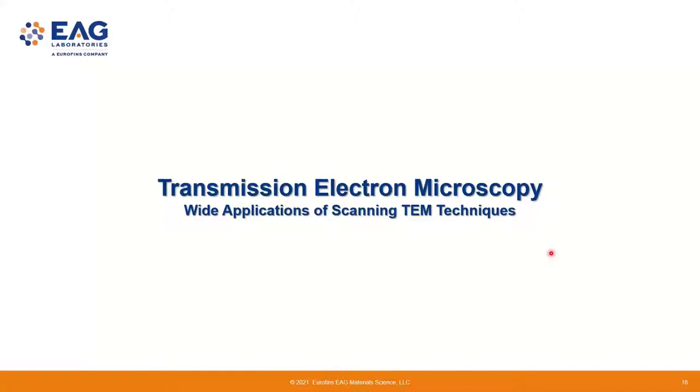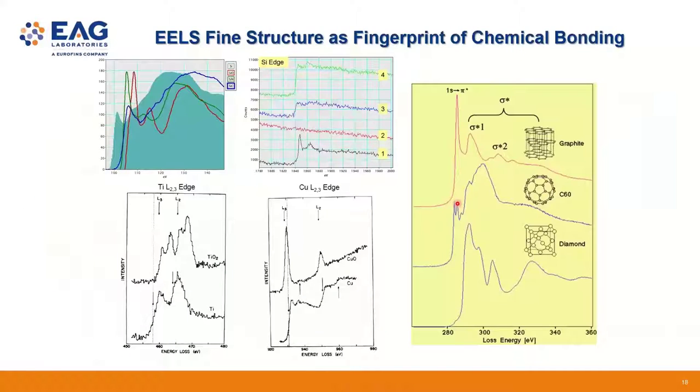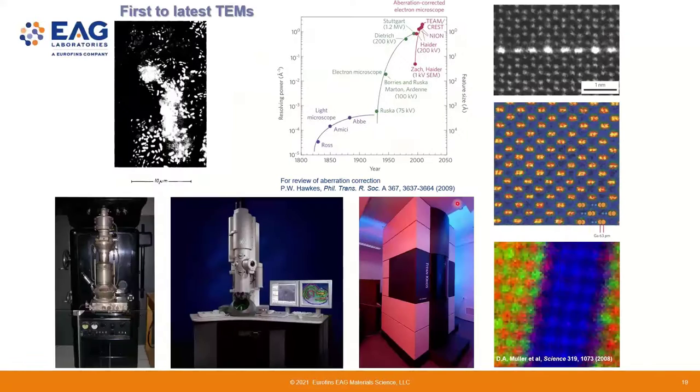EELS, again, for most of the time is a STEM-based technique. Nowadays you can collect EDS and EELS analysis simultaneously, an EELS data set, and then the rest is basically about data analysis, right, of the three-dimensional data cube. I think most of this audience knows EELS is also very sensitive to the chemical bonding of the elements.